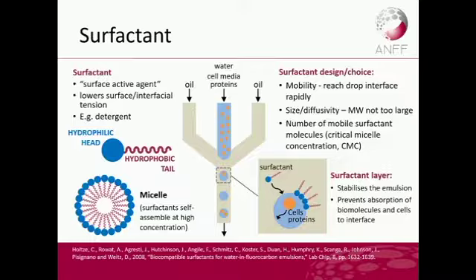And in this system here, where you have water, cell media, and proteins per se, flowing into oil, if you have surfactant, what happens initially is the surfactant will come to the surface, see the blob of the droplet of water there, and the hydrophilic head will be heading in, and the hydrophobic tails out. And what it does is over time it creates a barrier around that droplet there.